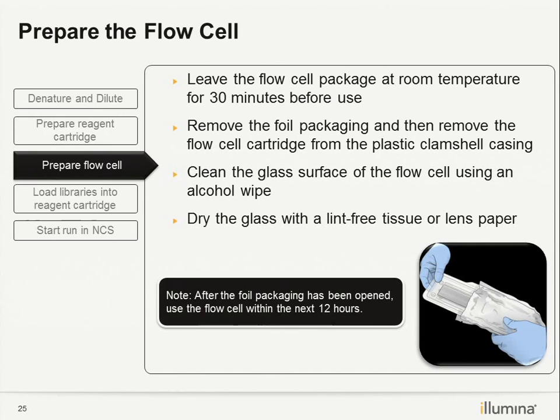And for the reagent cartridge, you can also put it at 4 degrees, but the maximum is 16 hours. Okay, so if you already thawed it the night before, then you had better stop the run. But if you just thawed it today, then you can still keep it for a few hours.